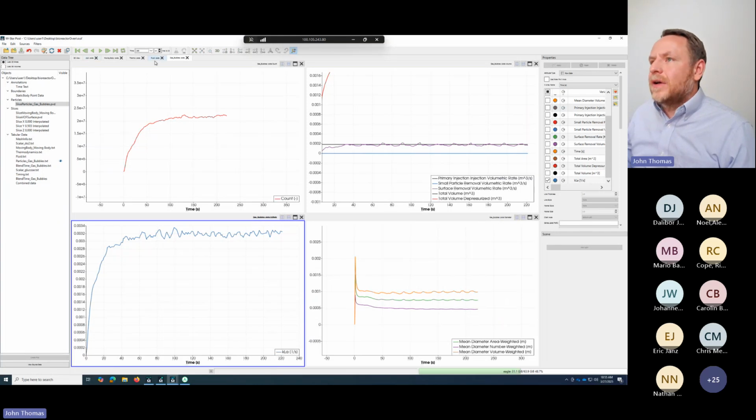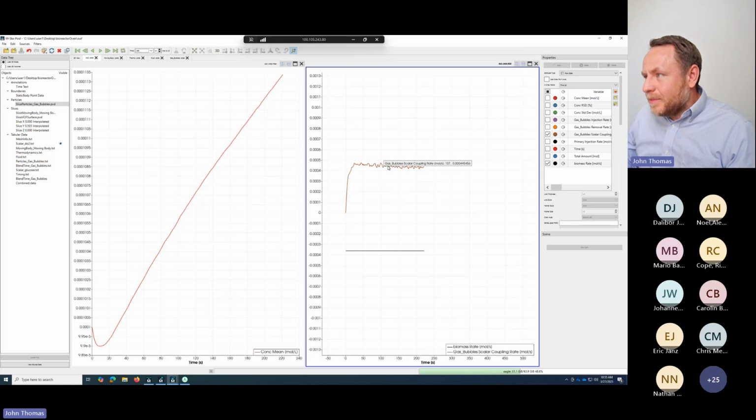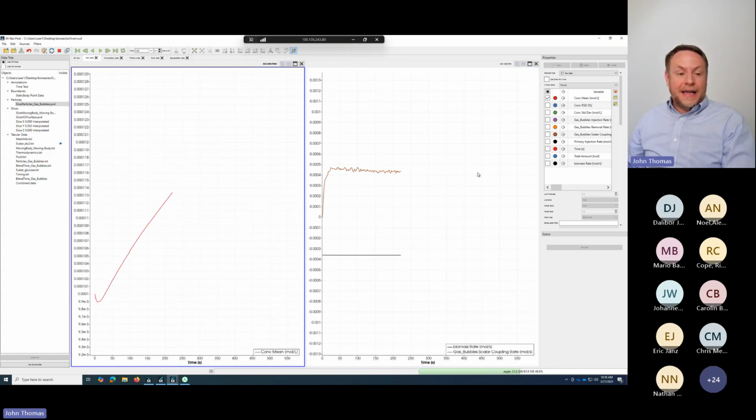But foundationally, here's the thing. I now have, for this DO, the oxygen transfer from the bubbles, as well as ongoing consumption. And right now, I'm pouring more oxygen in than I'm consuming. As a consequence, my mean oxygen is going up. As this mean oxygen concentration goes up, my OTR goes down. There's less of a driving potential. And this will go down until the transfer rate balances the consumption rate, and the concentration that achieves that flatlines.